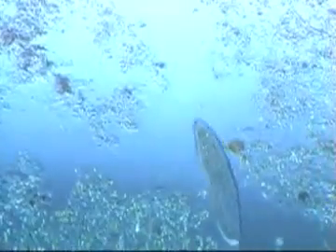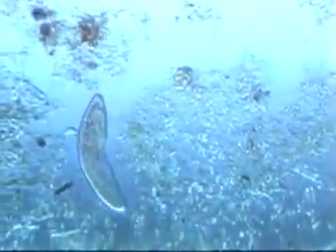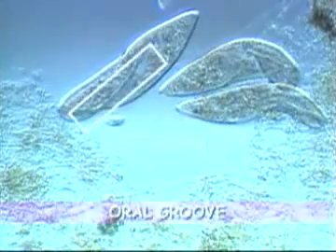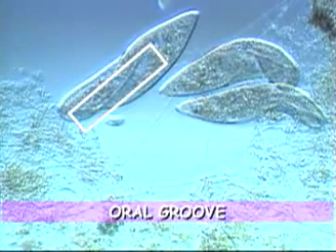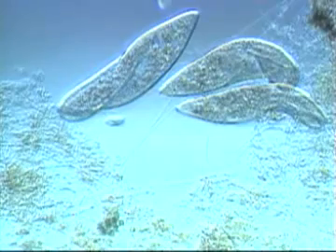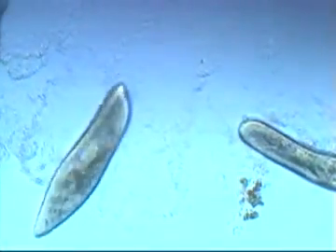A paramecium eats by swimming back and forth through pond debris, feeding mostly on bacteria. A paramecium doesn't have a mouth. Instead, it has an oral groove. This is a channel along the side of its body which directs food into its gullet or stomach. You can see the oral groove more clearly as paramecia rotate their bodies.